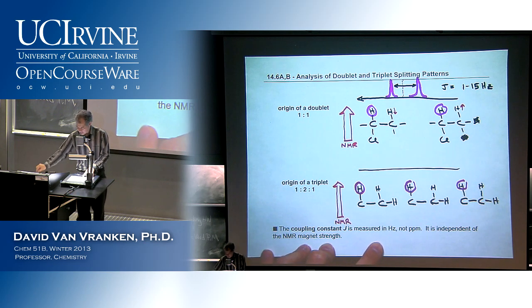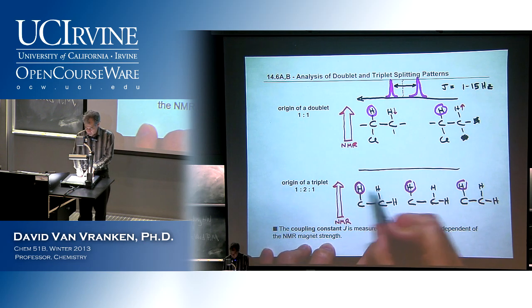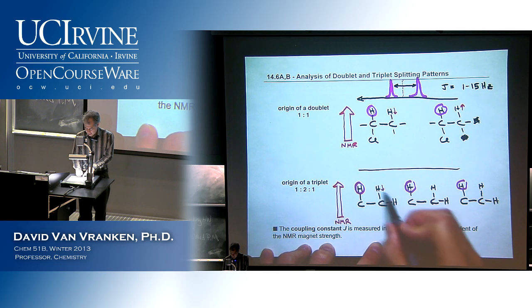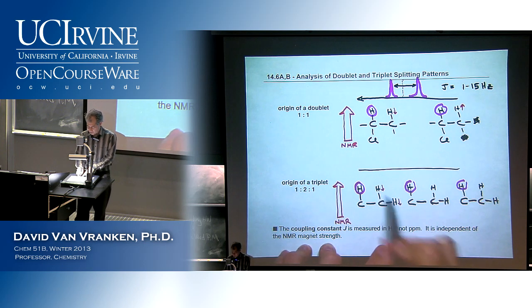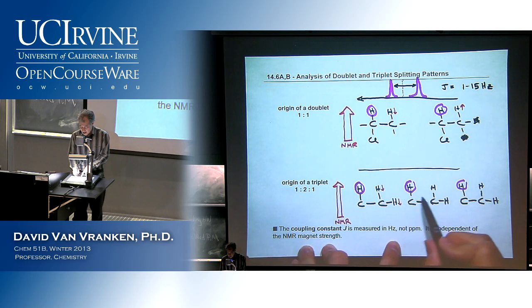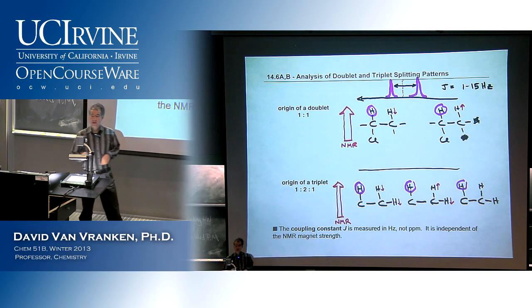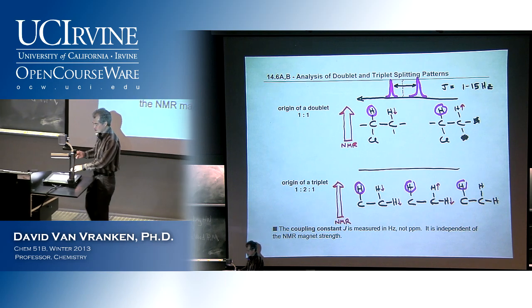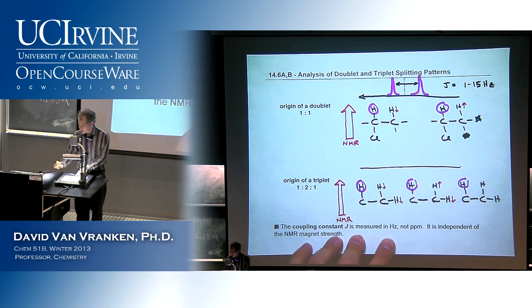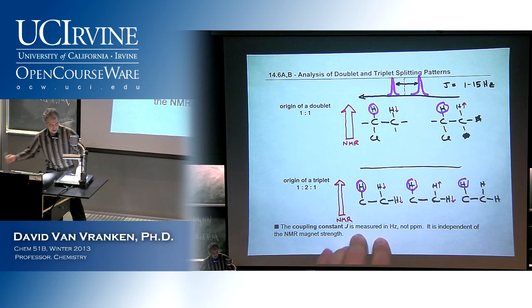What are those possibilities? So one possibility is that both of these protons have spins that both align opposite the NMR magnetic field. And so they're both subtracting in the same way. The other possibility is I have a proton that has spin up and the other proton has spin down. And so in effect, they'll cancel each other out. It's like that proton doesn't even have any neighboring protons because these two neighboring spins can cancel each other out. And there's two different ways you can end up with that scenario.